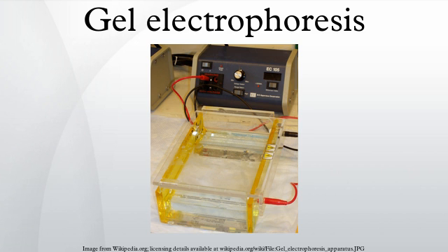Electrophoresis of RNA samples can be used to check for genomic DNA contamination and also for RNA degradation. RNA from eukaryotic organisms shows distinct bands of 28S and 18S RNA, the 28S band being approximately twice as intense as the 18S band. Degraded RNA has less sharply defined bands, has a smeared appearance, and the intensity ratio is less than 2:1.